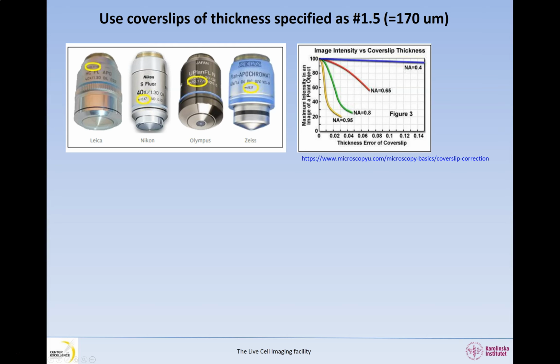However, a numerical aperture of 0.4 will exert almost no influence on the image, with the same thickness deviation of 0.01 mm. To compensate for such error, well-corrected objectives are equipped with correction collars that can be used to adjust the spacing of their intermediate lens elements according to the cover slip thickness.